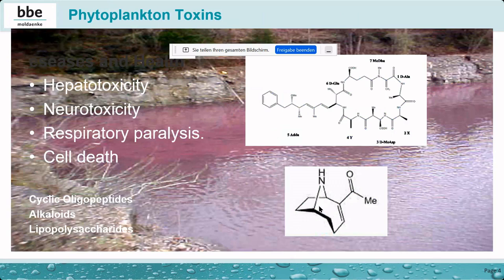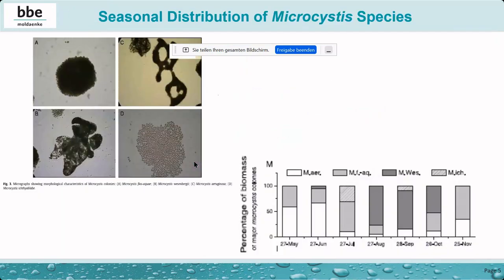So what I want to say is these toxins can come with the raw water and have to be omitted during the process. So it's important to know when the water is contaminated with such cyanobacteria. Here in the background, you see an algae bloom of such a blue-green algae, the cyanobacteria called oscillatoria. Toby will show more about this later.